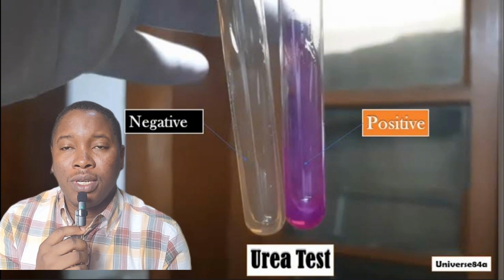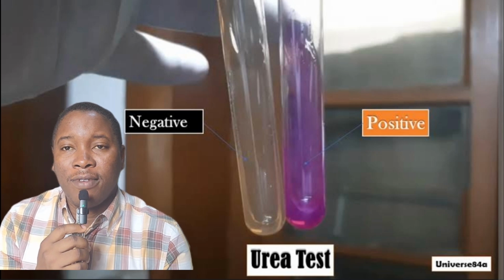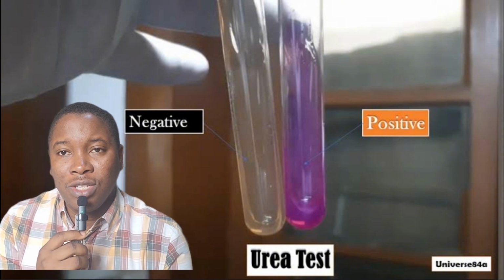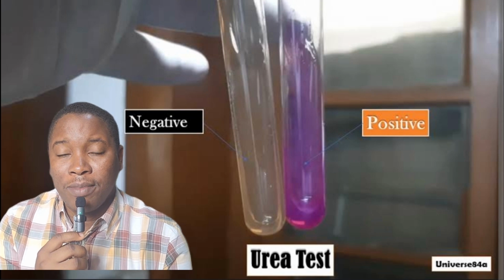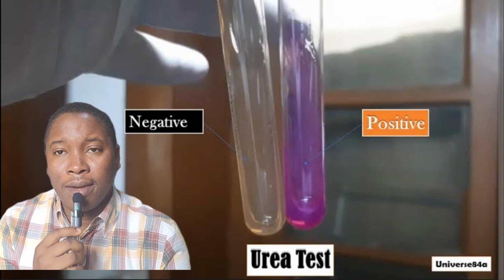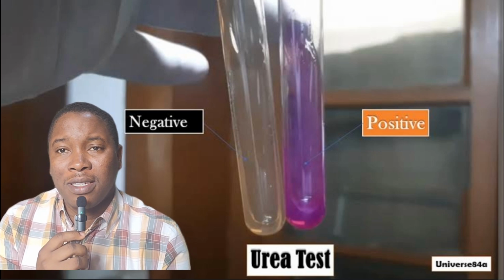Now, ammonia, we know, is alkaline, basic in nature. So when you have an acidic medium and the release of a base into it, it will raise the pH of that medium. If you have a medium at something like 6.8, which is slightly acidic, and then you have the release of ammonia into that medium, it changes the pH of that medium. So seeing if urease is present is a very simple test.